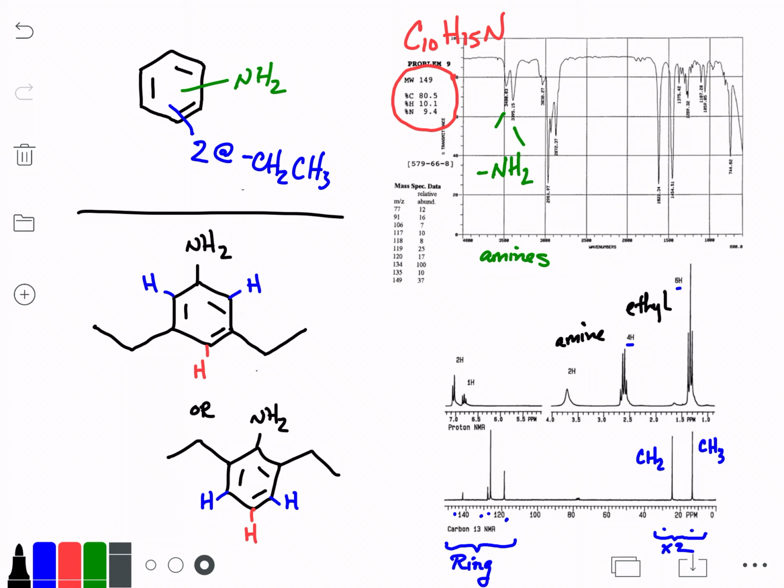This is showing me the one hydrogen in one place and two hydrogens in another place, which is what I would expect. But what I want to look at is the relative positions of those two. So I know that these guys are from my ring, but I need to know how they work. And what I want to point out is two things. One is the relative shift.